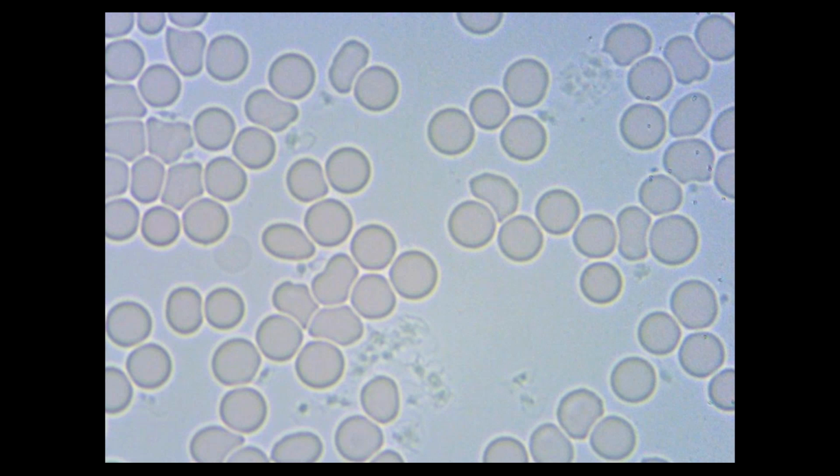Sure, absolutely. Well, some people, when they hear dark field, immediately think of pleomorphism, and they choose then not to do dark field because they're not using pleomorphism themselves in their analysis. But there are actually many other very important anomalies that can only be seen in dark field. Now, the first one that comes to mind is fibrin, which is of course related to liver stress. This is a very common finding in live blood analysis and really important to be able to see at an early stage. The chylomicrons, those small motile particles that move around in the plasma, are only seen in dark field.